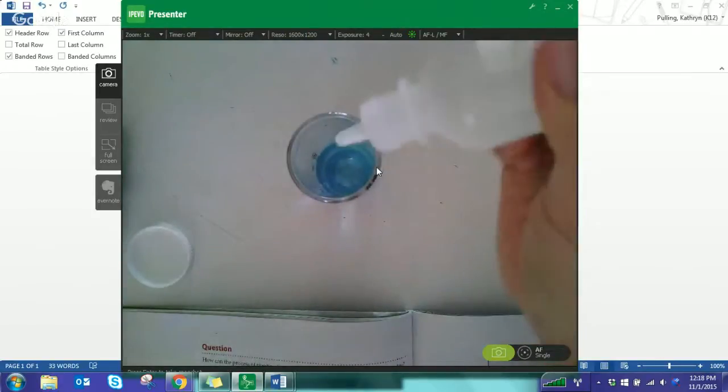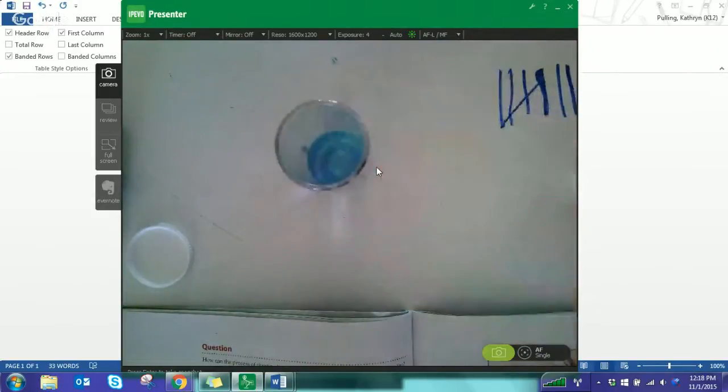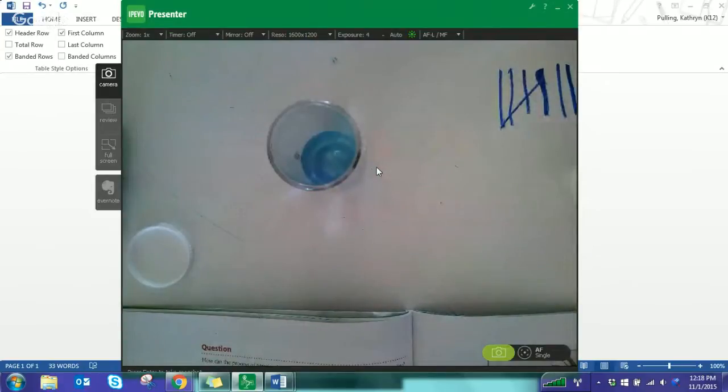And 9. This one's number 10. So definitely, it's taking a while for that change between pH 8.3 and 4.5.